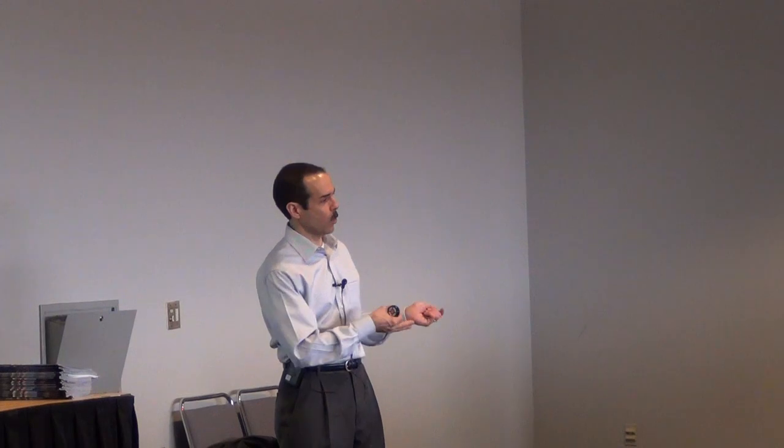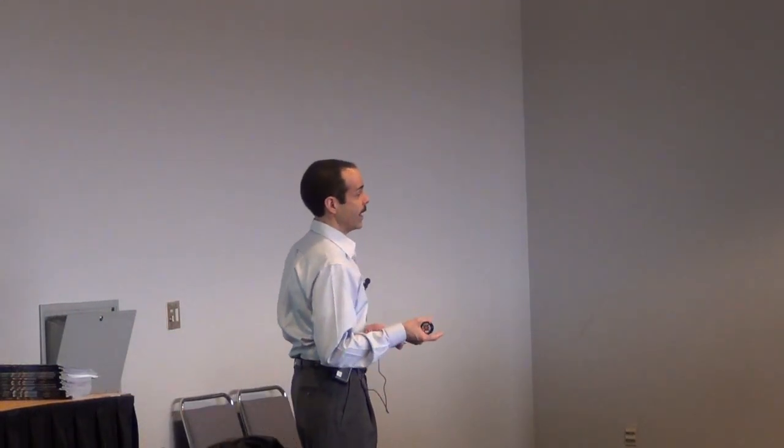The idea is to clean the electrode often enough so that it has an effect. If you wait months and months and try to clean your electrode, it's probably not going to work as well as if you keep on top of cleaning it. So when you need to clean the electrode, again, keep track of that slope. That's the single best indicator on when you need to clean the electrode. The ideal range, as I mentioned before, was 95 to 102. The cleaning range for the electrode is 92 to 95. So as it drops below 95, clean that electrode.